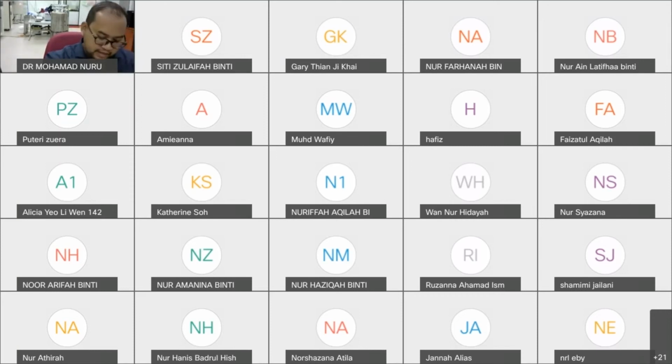Okay, and lastly, the most important thing is the solvents. Make sure you mention the correct solvents. If not, the system cannot lock and shim the samples. So the experiment will fail.